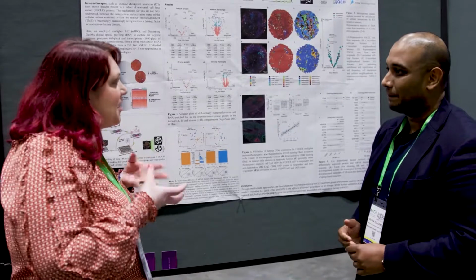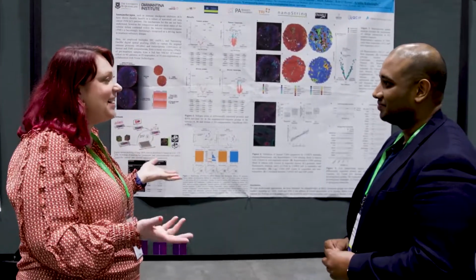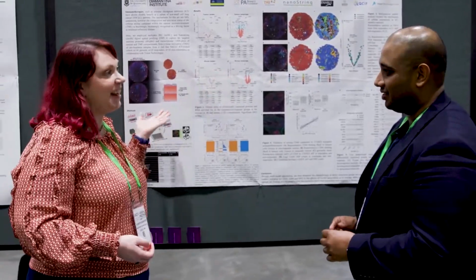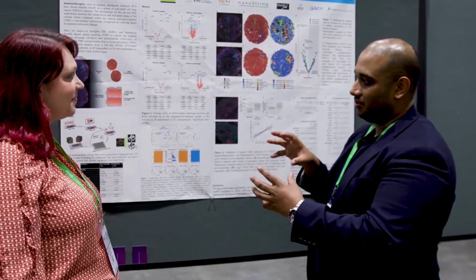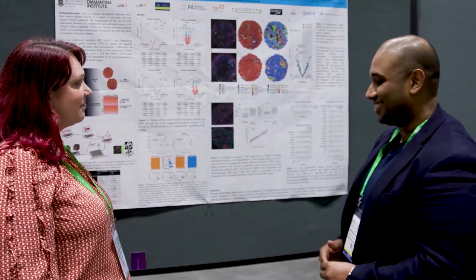Yeah, because if you looked at bulk analysis, you may have missed that, right? Exactly. It would have gotten hidden. So you essentially found a needle in a haystack. Yeah, exactly. And because we can compartmentalize the signal to tumor or stroma, it's a broad way to really discover biomarkers using this strategy. So yeah, we're very excited by it.